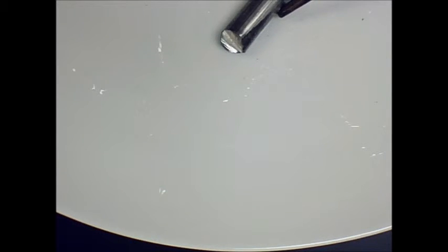All right, so here's lithium. And you can see how shiny it is inside. It's a little bit harder. It's not quite as soft as the others. We're going to get a little piece off over here. And that's the gray oxidized coating on the outside we talked about. And one more time, let's see what happens.